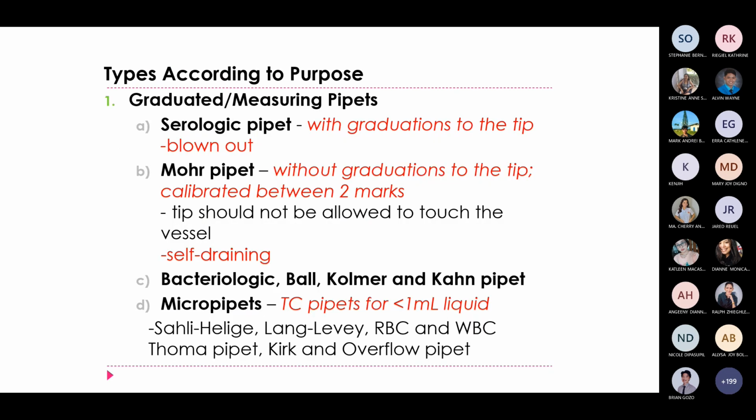Okay, next one, according to purpose. So, graduated or measuring pipettes. Kahapon, nag-iisip talaga ako paano ba natin ito matatandaan. Sorry, kayo na lang ang mag-isip nito.